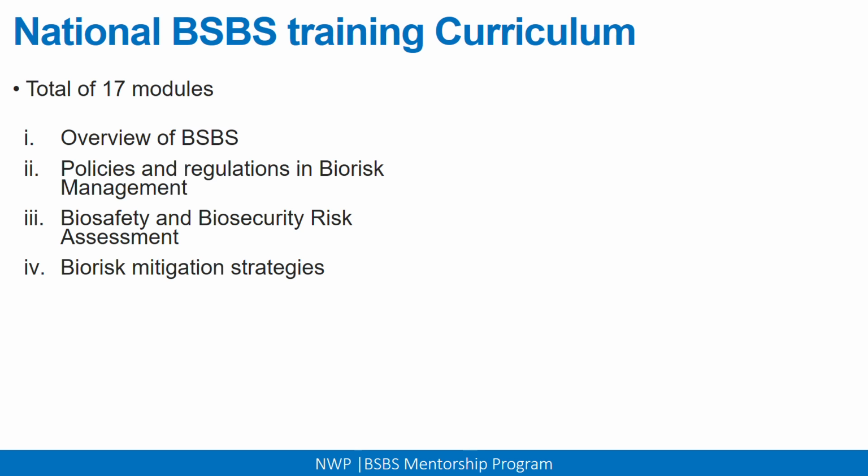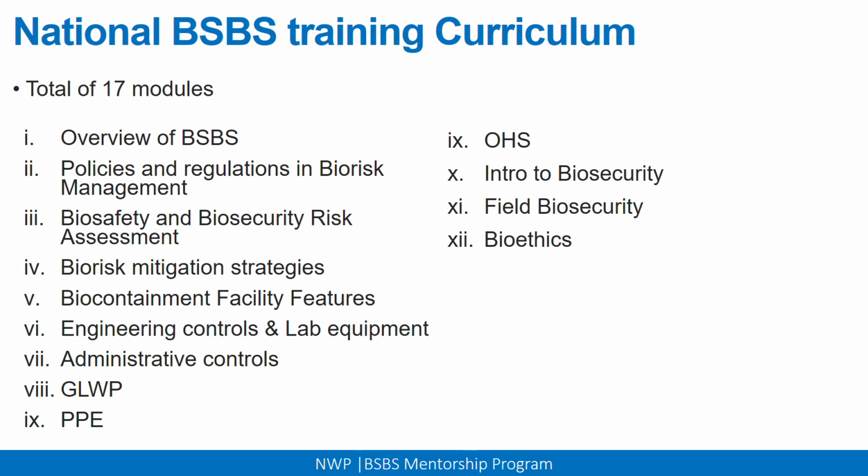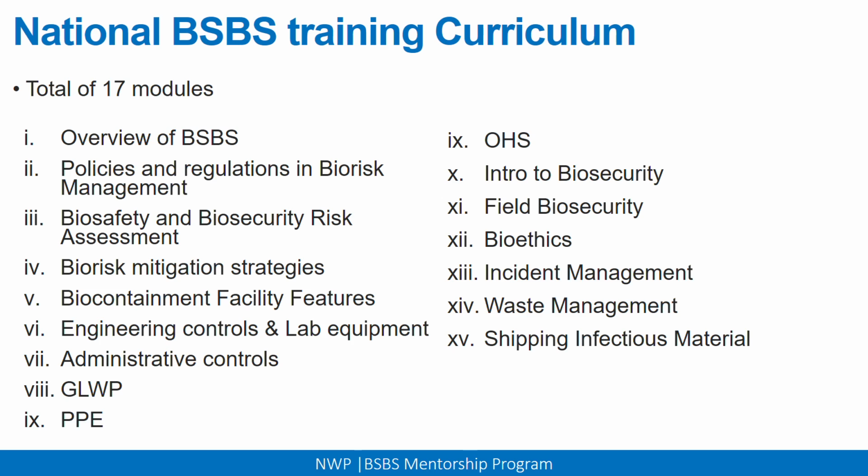Then biorisk mitigation strategies, biocontainment facility features, engineering controls, administrative controls, good laboratory work practice, personal protective equipment, occupational health and safety, introduction to biosecurity, field biosecurity, bioethics, incident management, waste management, shipping infectious material, and 17, which is audits and inspection for biorisk performance. These are the modules that are part of the National Biosafety and Biosecurity Training curriculum.